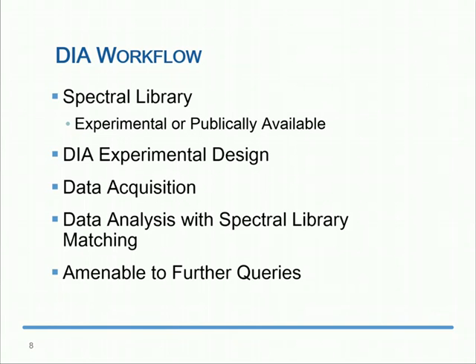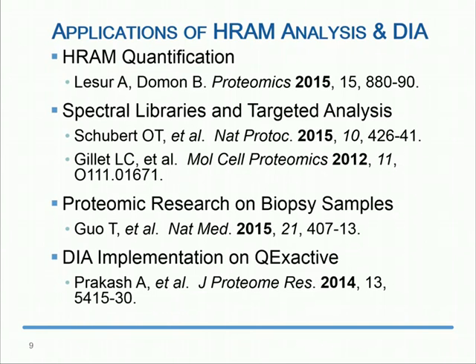Now, I think the important caveat is that you'd want to make sure that you are identifying the proteins with other peptides rather than just relying on the identification of a mutant peptide. But the nice thought on this is that with a DIA sample analysis, you'd be able to come back to it with new ideas, and it would be a little bit more fruitful in terms of developing additional use of the data.